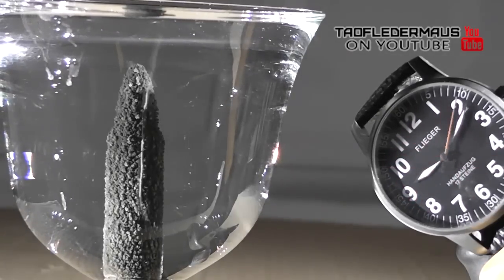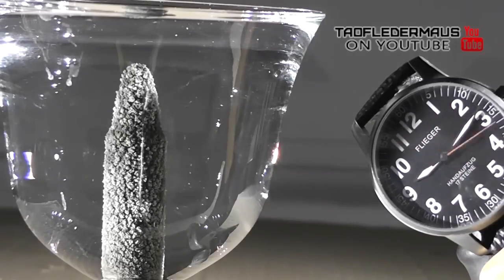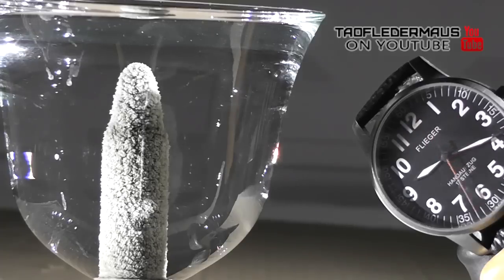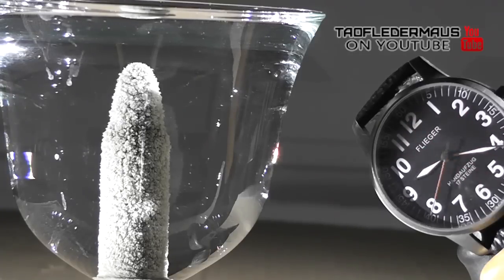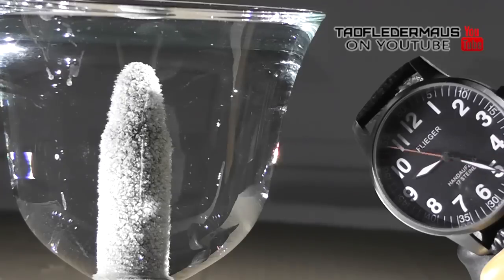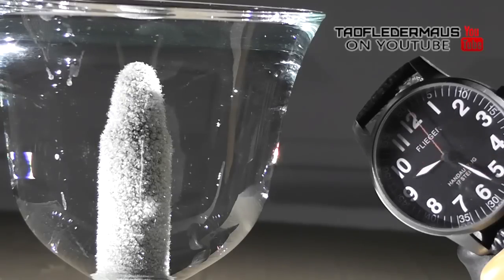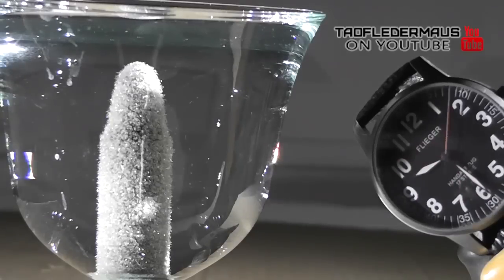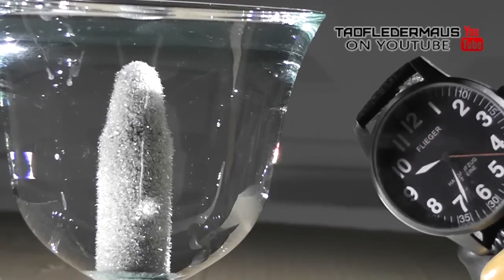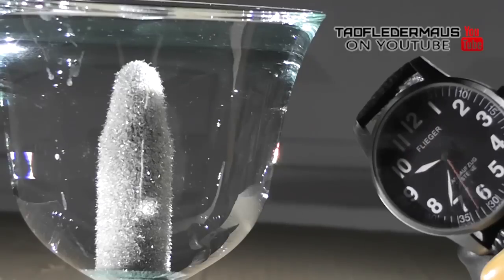The cartridge gradually accumulates crystals of pure silver. Each copper atom loses two electrons, and the two electrons are acquired by two silver ions. This was all filmed in about 30 minutes of time. The reaction was pretty fast, and it didn't take very long to build a shimmering coat of silver on this rifle cartridge.